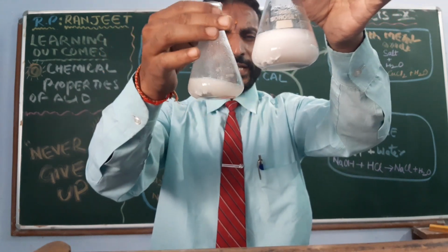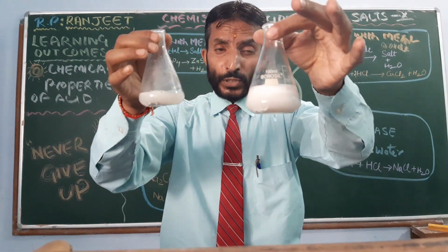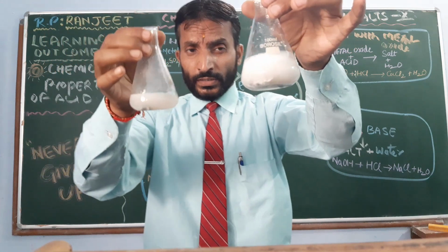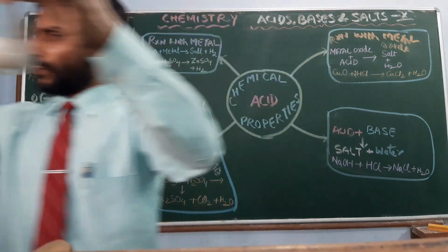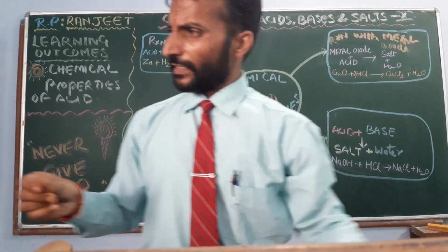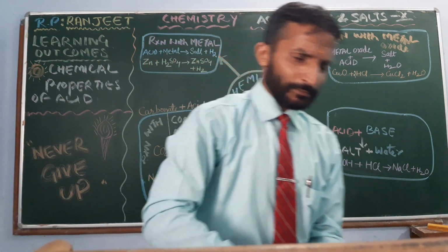I have already added both for you to show that this time the pop sound should be there in a prominent amount. Let us see. This one also has zinc in sulfuric acid. Now I will show the pop sound. I will take a burning matchstick near it.